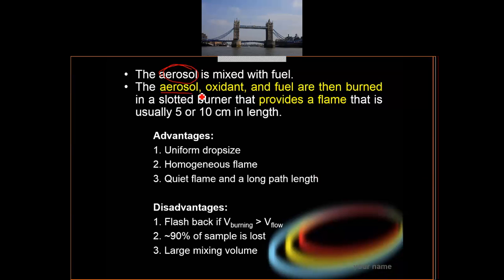So please remember this one: aerosol, oxidant, and fuel. These three are being burned. Aerosol is the sample, oxidant is the thing that helps the burning process. Fuel is the thing that we will burn. Three things. Oxidant normally is oxygen. Fuel, in this case, is gas.